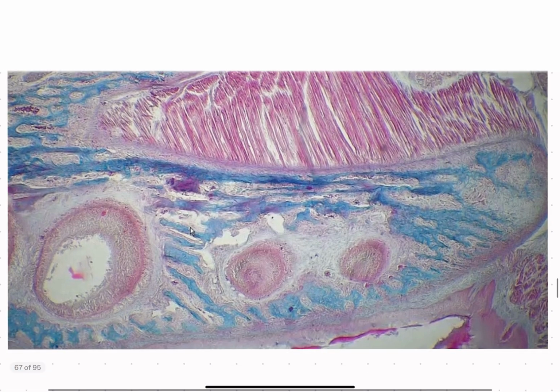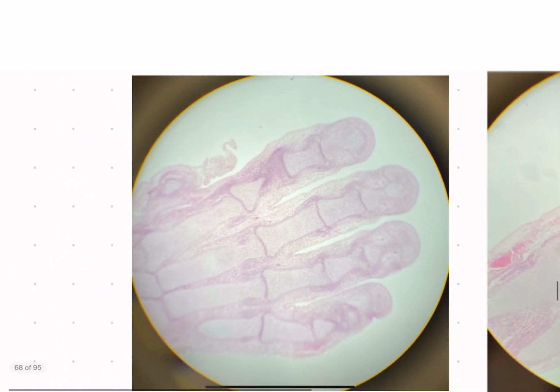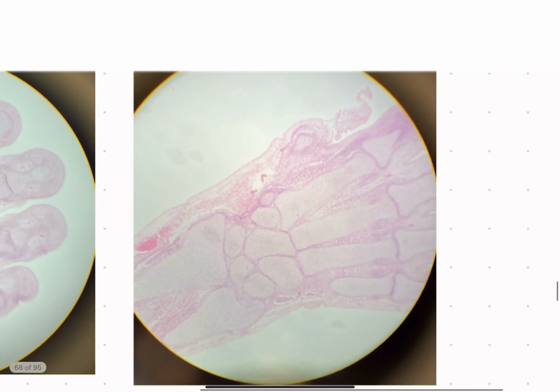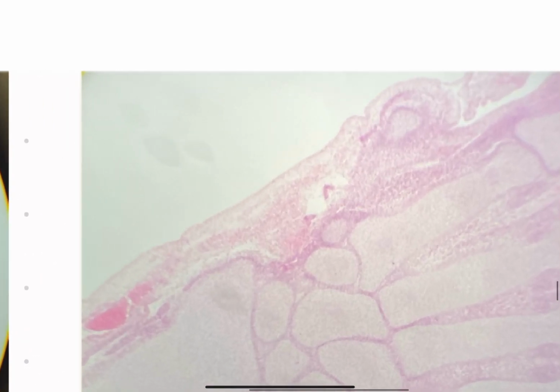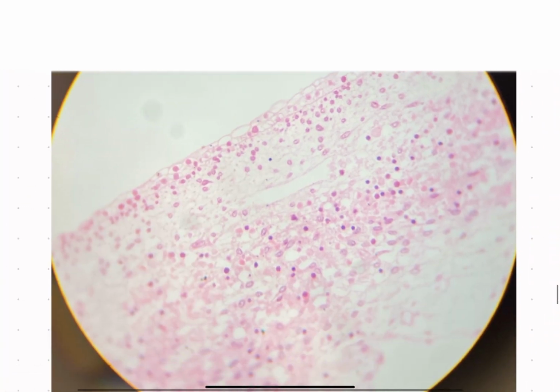Alright, let's move on. So we see something like this. And then we go a little bit towards the left to see this general area. Now zooming in towards this area, we see something like this.